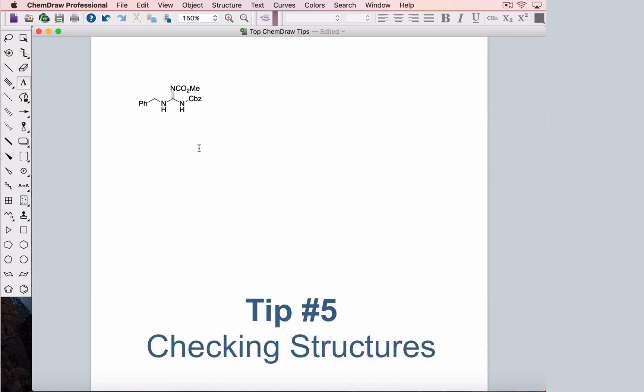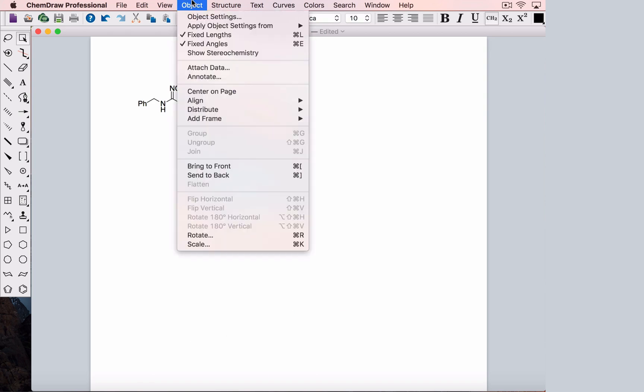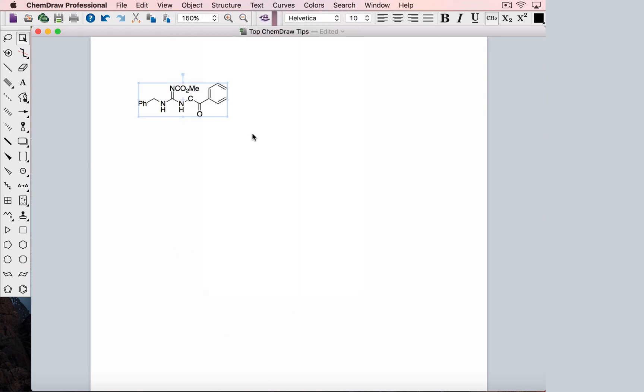Let's go back to our structure with the CBZ group abbreviated. Imagine that you misremembered how the abbreviation was written and you capitalized the B. Now when we expand the label, ChemDraw thinks this is a carbon bound to a benzoyl group and our structure contains an error.